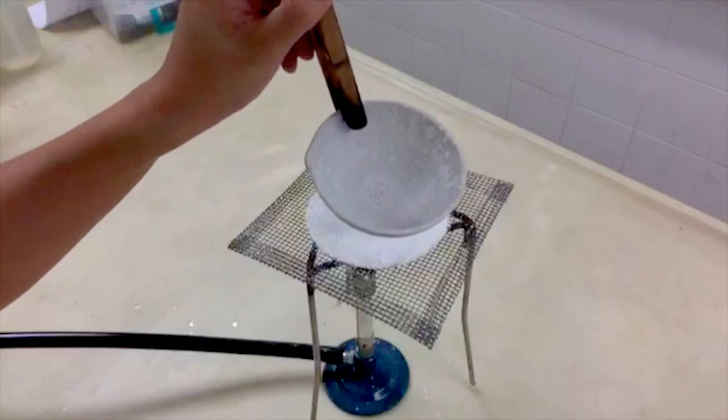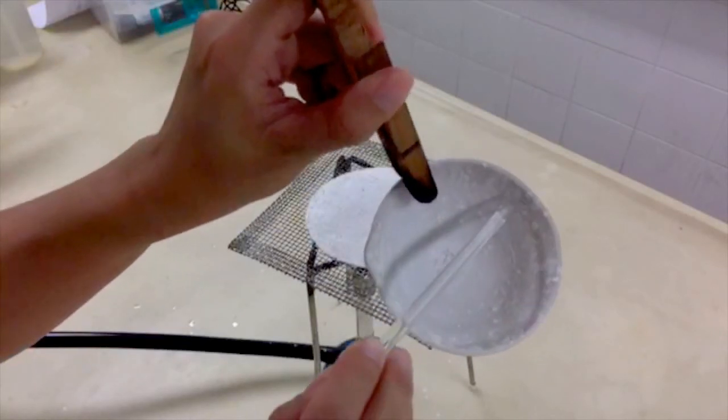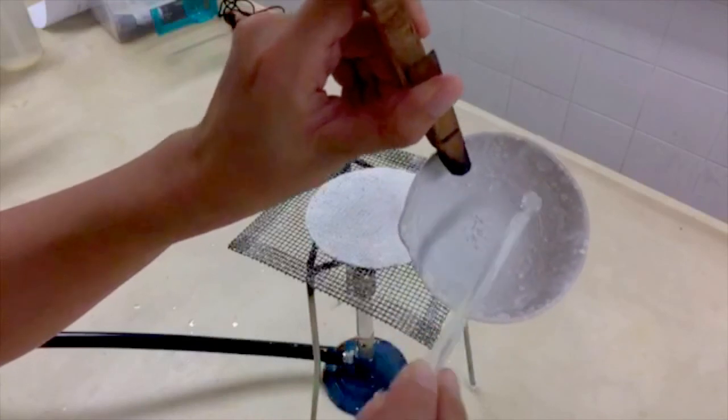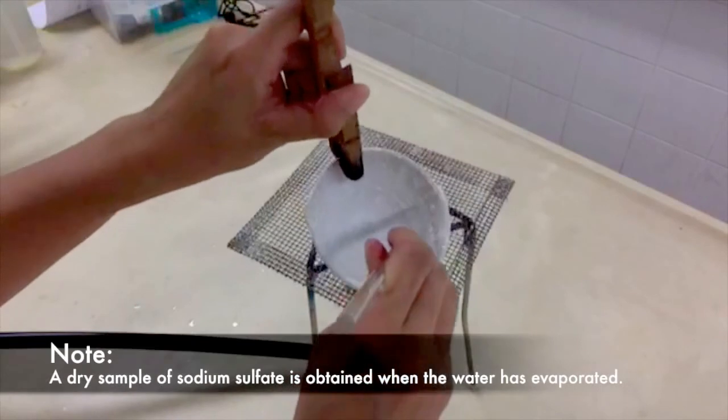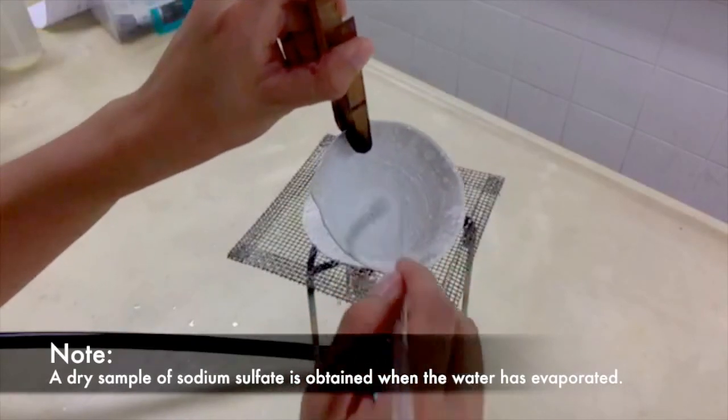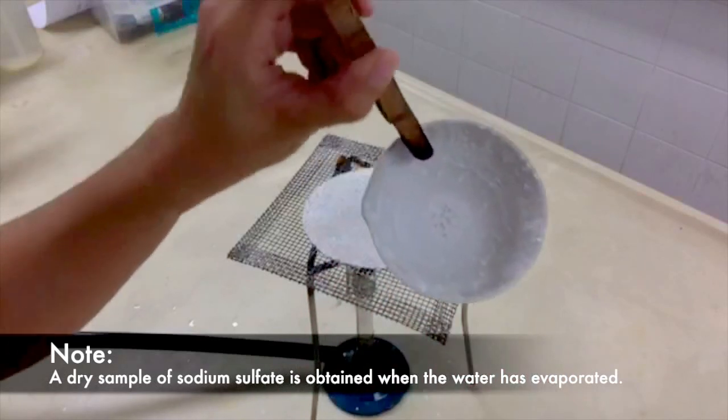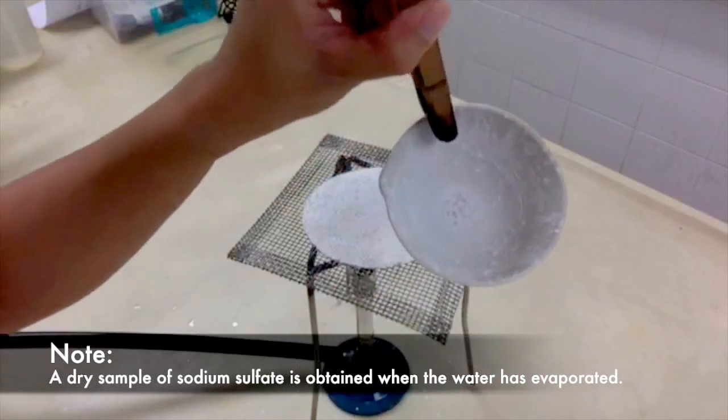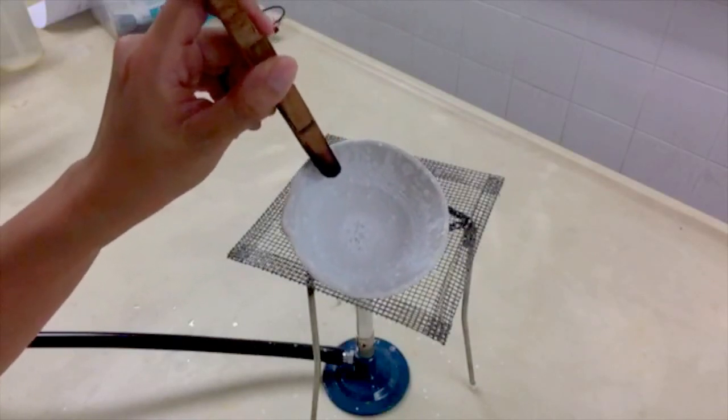Now you will have to heat it till all the water in the solution has evaporated. Once all the water has evaporated, turn off the flame and you will be able to see all the salt that is at the side of the evaporating dish. When your evaporating dish has cooled down, you will be able to scrape all the salt off the dish and you can collect the salt - this salt is known as sodium sulfate. And with that we have come to an end of this experiment.